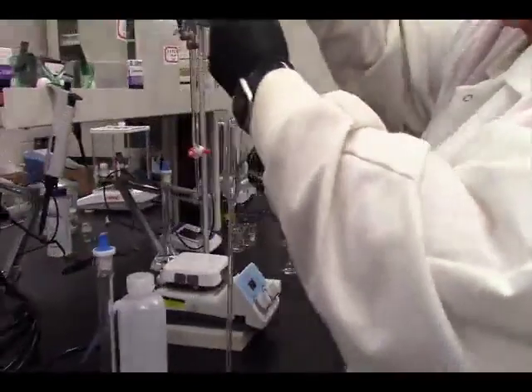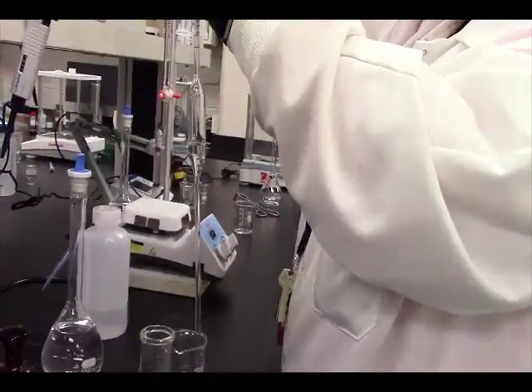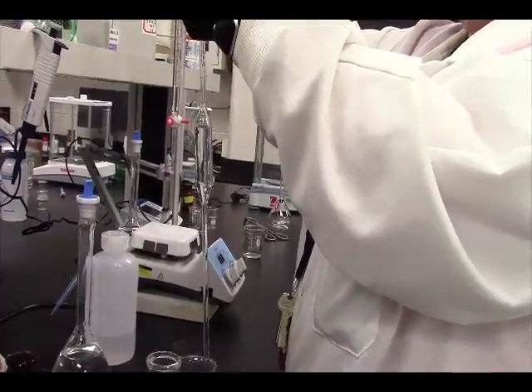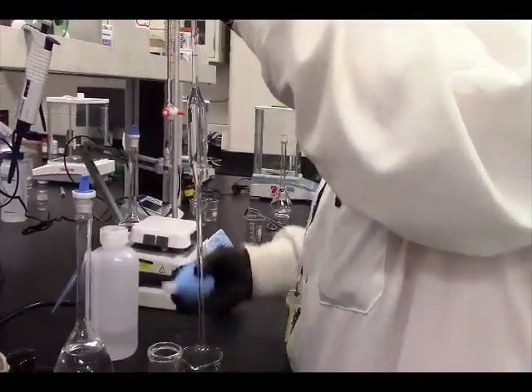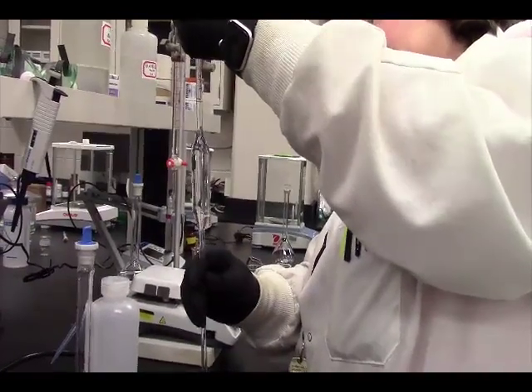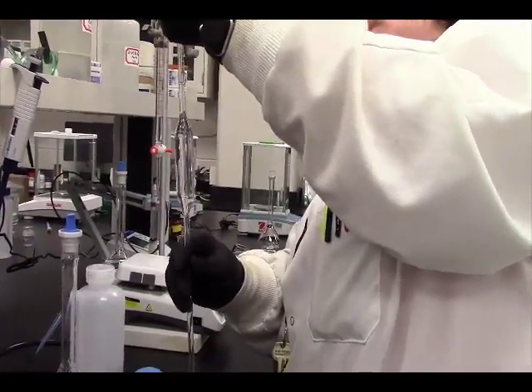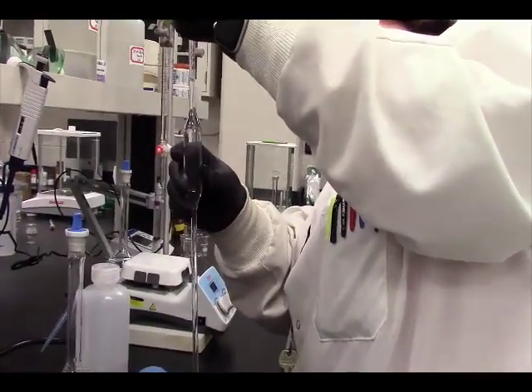All right, 25 milliliters of our iodate solution to 2 grams of KI. And to that, we're going to be adding 10 mils of 10% sulfuric acid.